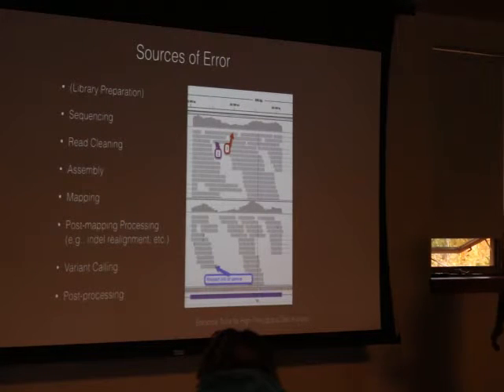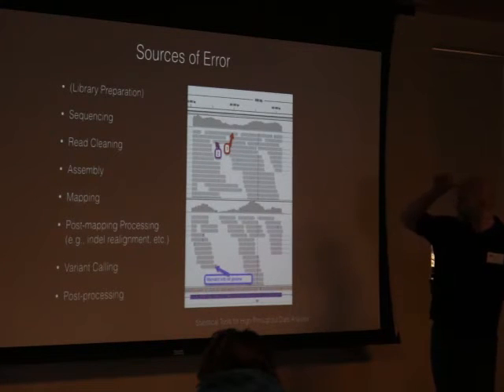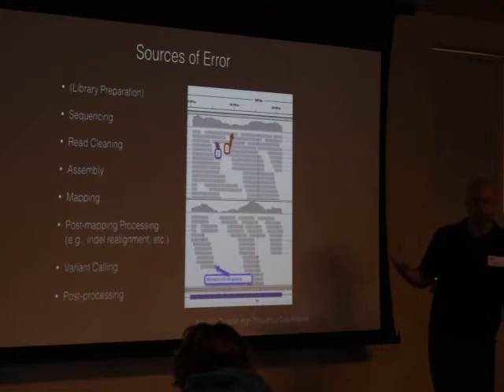As you might expect, this approach is very error-prone. My guess is that you went over some of this yesterday, but error can be introduced at a bunch of different steps. The first is going to be library preparation. This has to do with more molecular sources of error.